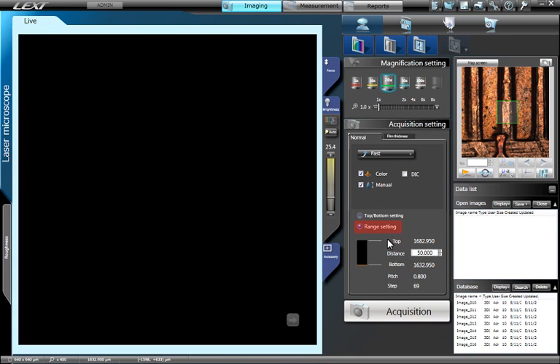Also, by selecting the Range mode, you can manually define the Acquisition Range or distance traveled in Z. Enter the desired distance, then focus at the bottom of the feature and press Acquisition. The acquisition will start at the bottom, traveling upward in Z as per the predefined distance.